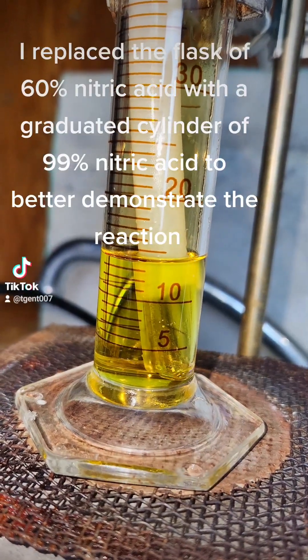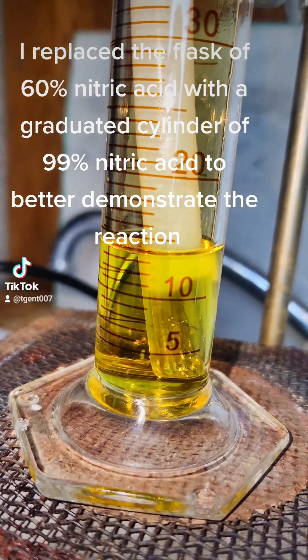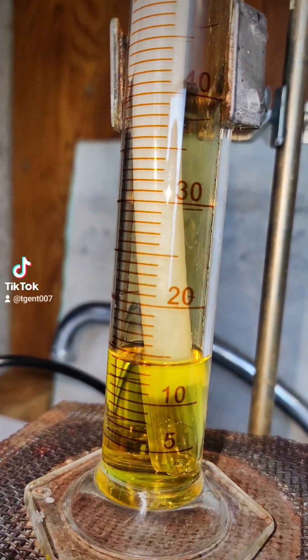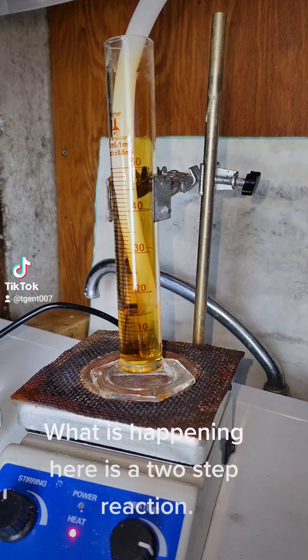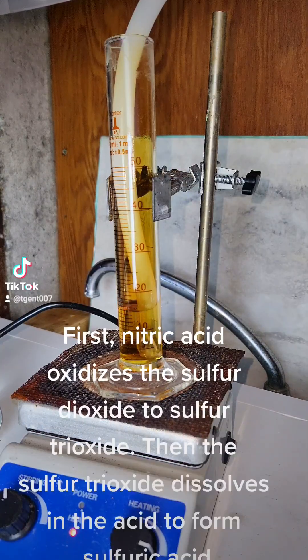I replaced the flask of 60% nitric acid with a graduated cylinder of 99% nitric acid to better demonstrate the reaction. What is happening here is a two-step reaction. First, nitric acid oxidizes the sulfur dioxide to sulfur trioxide. Then the sulfur trioxide dissolves in the acid to form sulfuric acid.